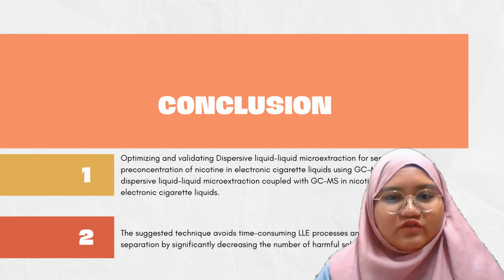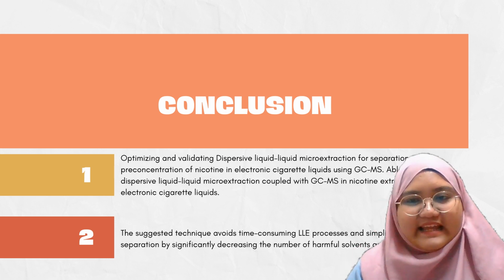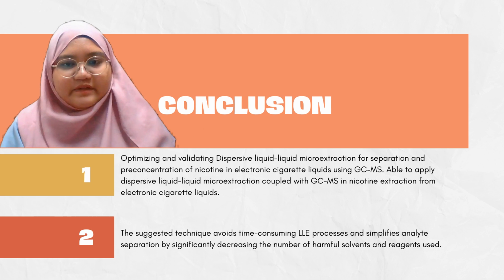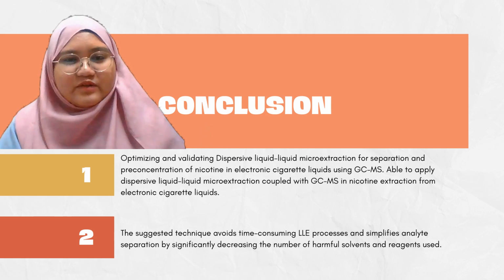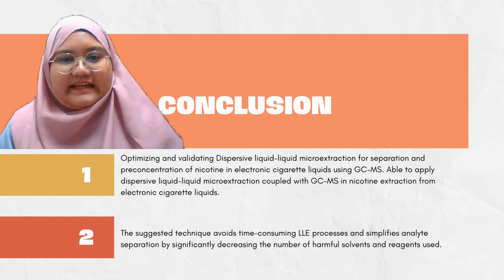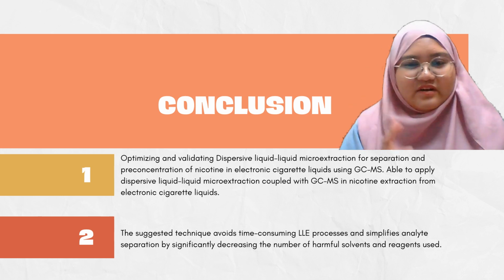In conclusion, I was able to optimize and validate the DLME for separation and pre-concentration of nicotine in e-liquids using GCMS. I was also able to apply the DLME coupled with GCMS in nicotine extraction from e-liquids.